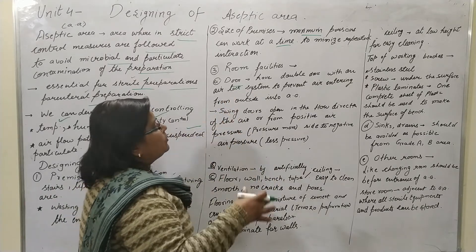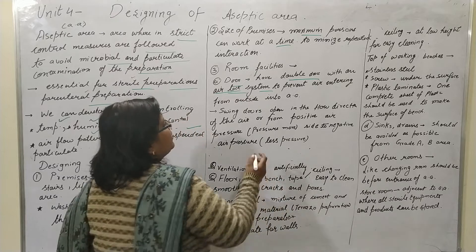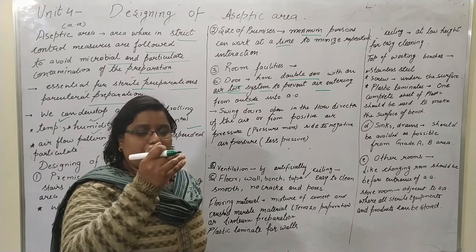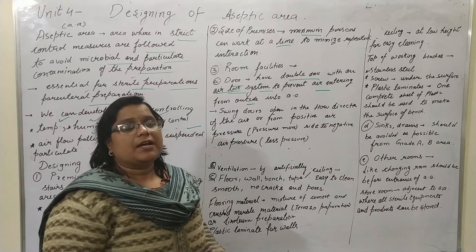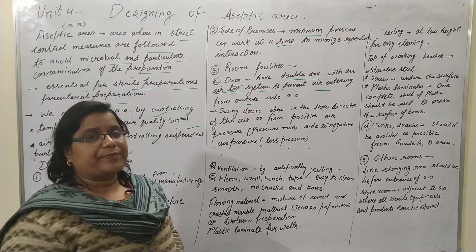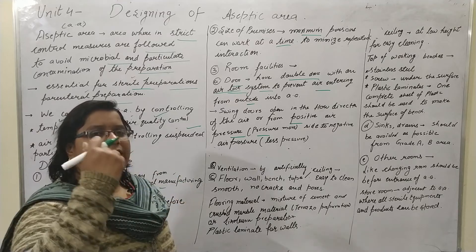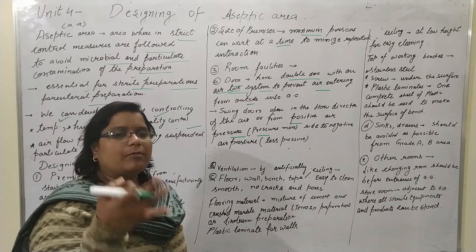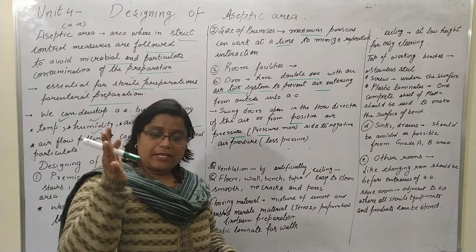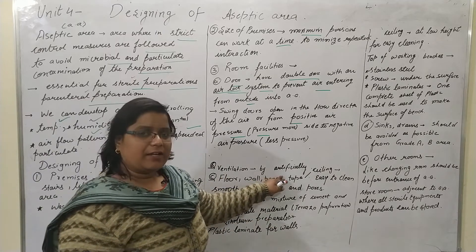Regarding room facilities, the door should have a double-door system with a proper airlock system to prevent outside air from entering the aseptic area. The air pressure inside the aseptic area is maintained higher than the outer area — this is positive pressure. Since air flows from high pressure to low pressure, air moves from inside to outside, so contamination proceeds outward automatically.